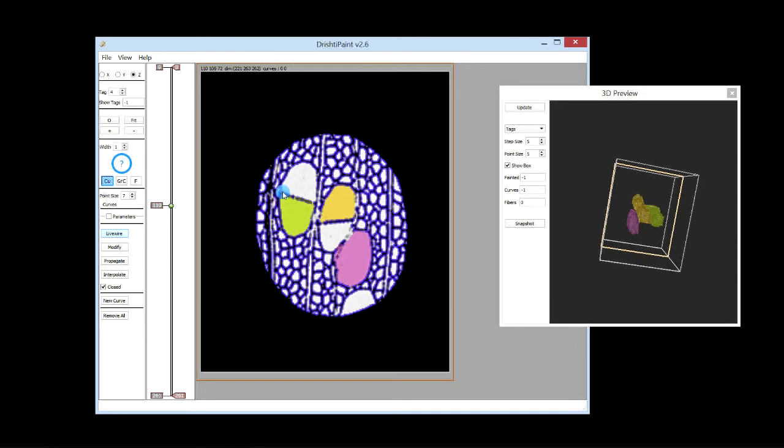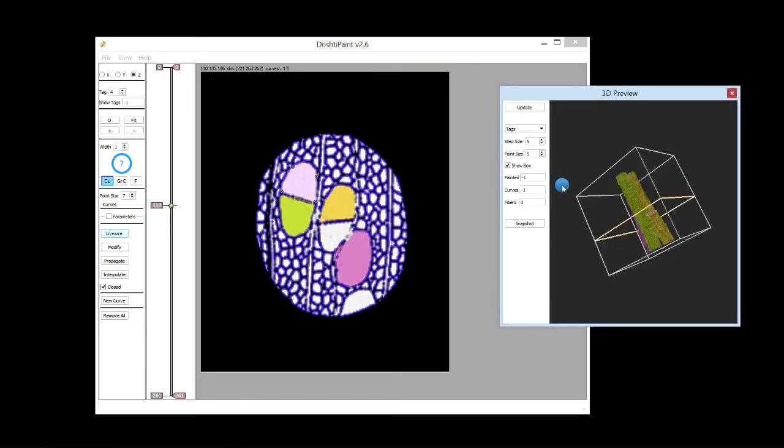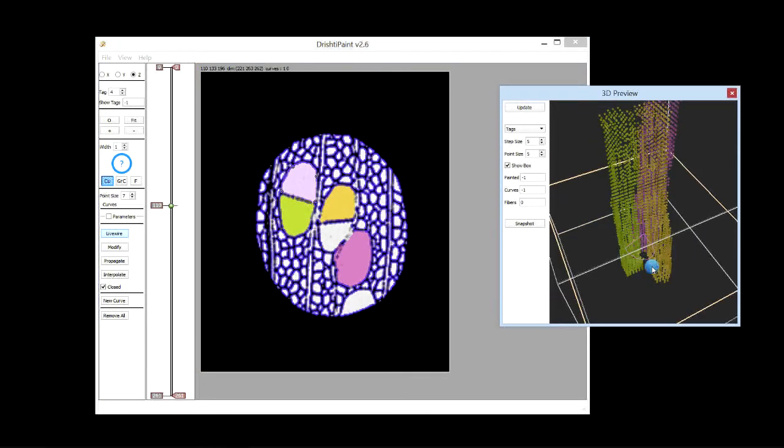So left click, and then I can start moving this curve here. I'm just moving the cursor, and then setting up the seed points using left click, and then press spacebar to connect the last seed point, which is this one here, to the first seed point. So spacebar, and we have set the, so this is where we have got the curve, this one here.